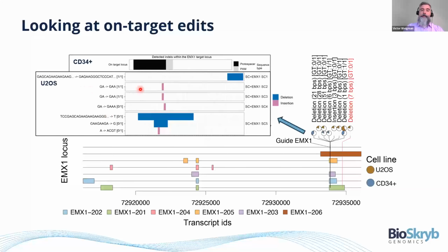Well, for U2OS, it's a completely different set of changes in some cases. In some cases, they're complete overlaps, which is great. But now we can really see individual variation. And of course, if we were to do bulk sequencing, some of these things may actually pop up. We can see a lot of commonality here, for instance, for this edit, which is fantastic, right?